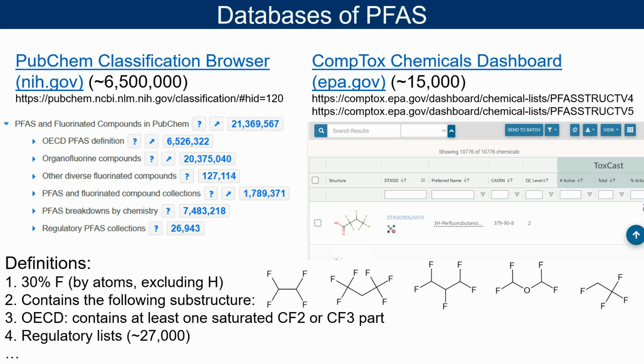So if it's a CO2CF3H2, for example, I'm just making something up, this would likely be a PFAS, because if you divided the 3 fluorines by the rest of the atoms, you get over 30%. So this is a very simple definition that is easy to execute and understand.